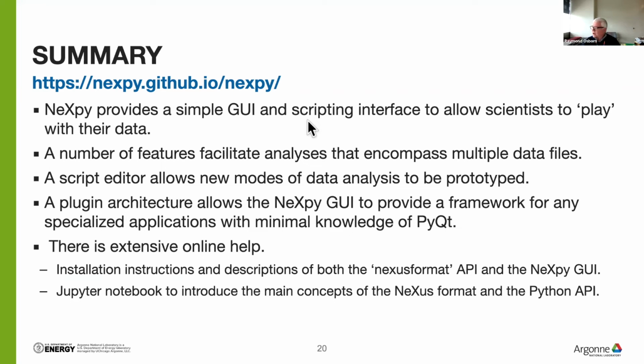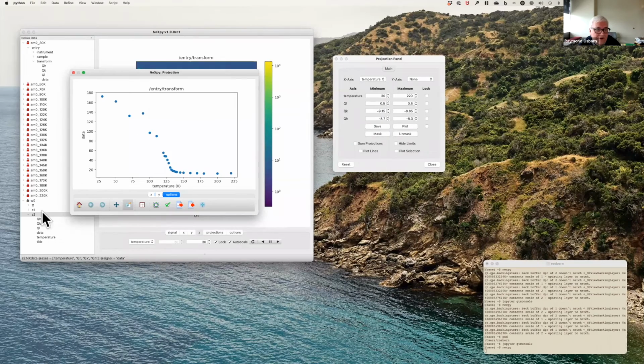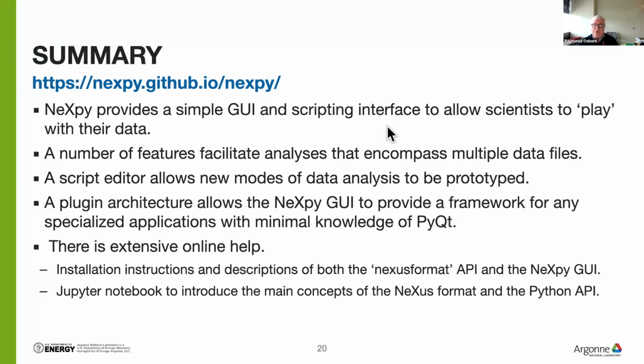I actually loaded all these files, which represent something like a terabyte of data, through external links mostly, but nevertheless they represent a terabyte of data, and yet we've been able to cut it down to a manageable size to extract information. Now, we're also working on machine learning, which is another way of approaching these kinds of big data sets, but that's a different story altogether.